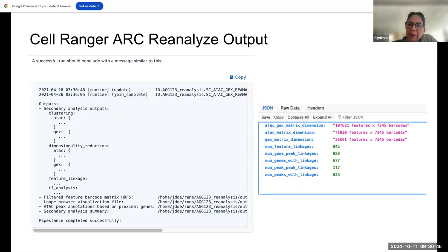If you have a successful run of Cell Ranger Arc reanalyze, you get a similar output that only runs on the secondary analysis — clustering, dimensionality reduction, and importantly the feature linkage, where we want the information on active regulatory elements in chromatin accessibility data associated with transcription. An additional file you will have is a JSON file that validates the run, confirming the pipeline successfully counted the provided barcodes and giving information about the number of feature linkages, gene-peak associations, and complementary data for further analysis.